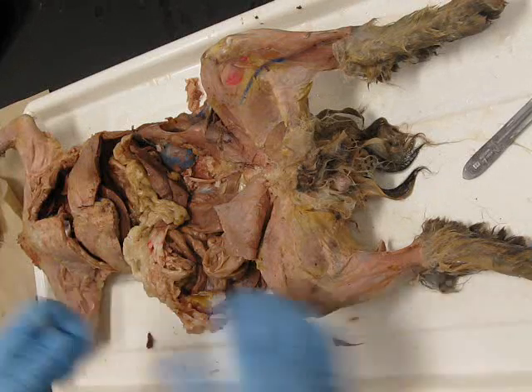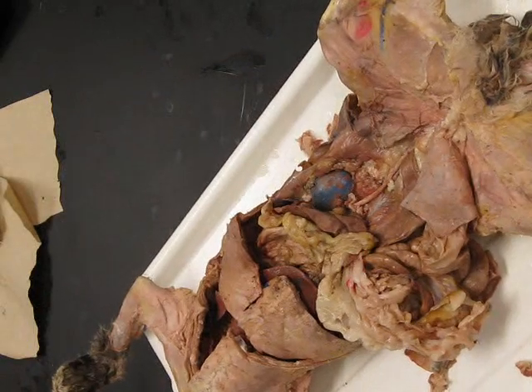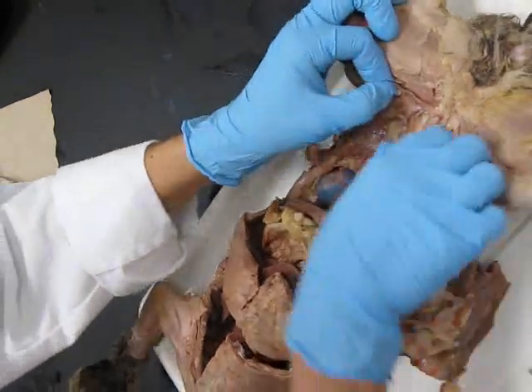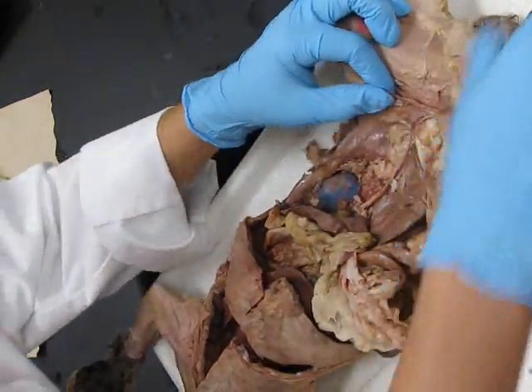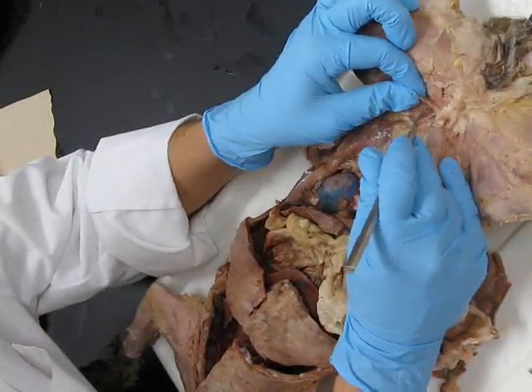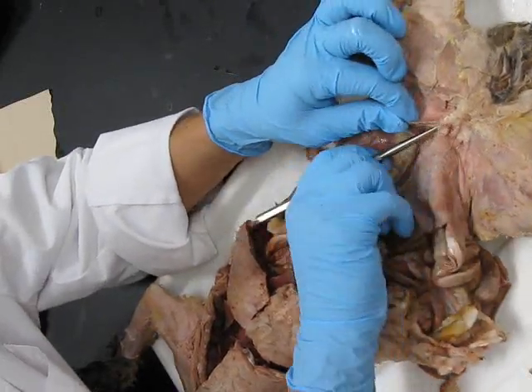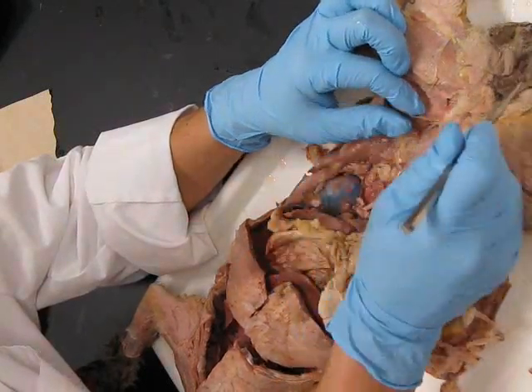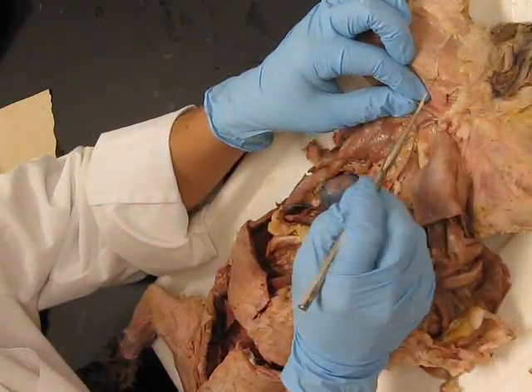Now the vas deferens are going to be white tubes that are coming through the inguinal canal. Now the inguinal canal is going to be at the base of the pelvis, in the abdominal pelvic wall, and here it is. And you see that the probe travels all the way down. It's a canal that will lead through the spermatic cord into the testis.